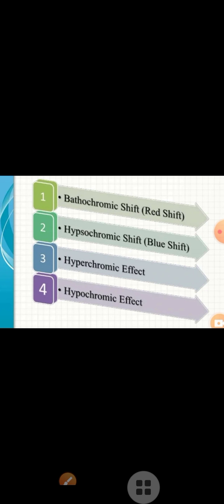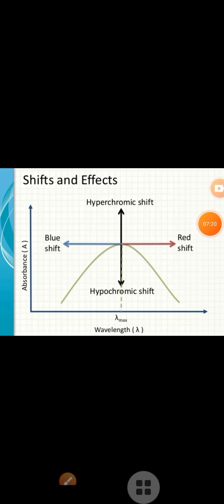The hypsochromic effect is called blue shift, and the bathochromic shift is called red shift. And greater absorption is the hyperchromic effect, and lower absorption is the hypochromic effect.